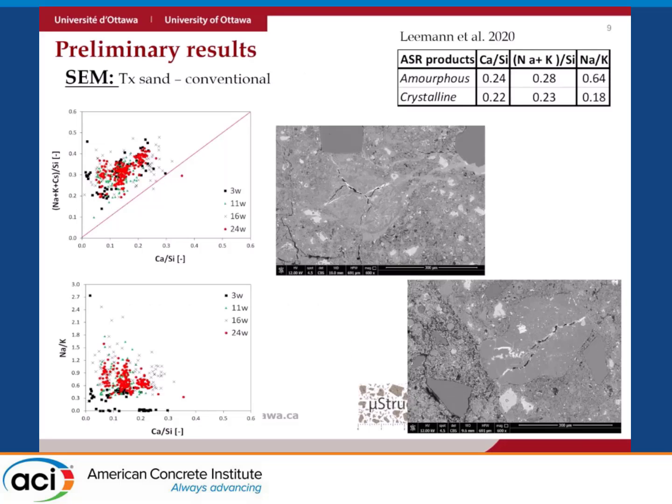Another thing of interest is that you can see very whitish products. Those whitish products are very easy to recognize because of the cesium nitrate, right? Normally we may detect those by morphology, by experience and so on, but the use of cesium nitrate really helps in the detection of the gel within the particles.